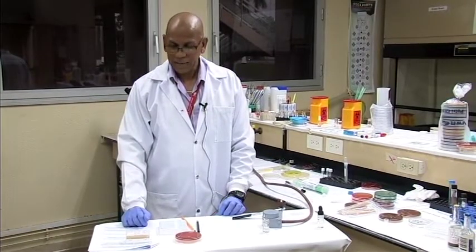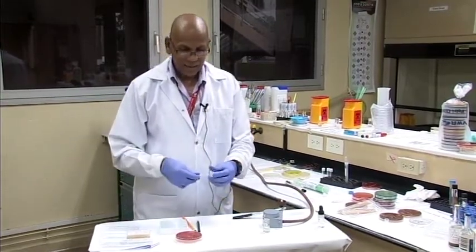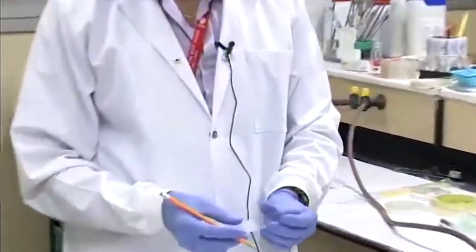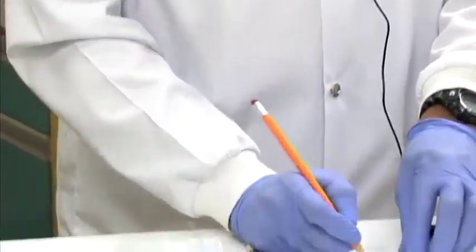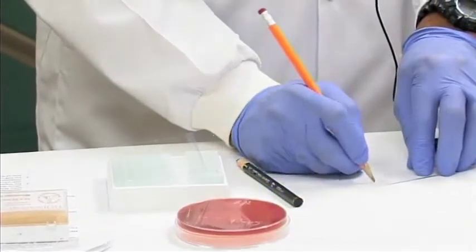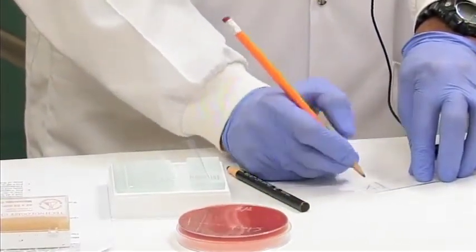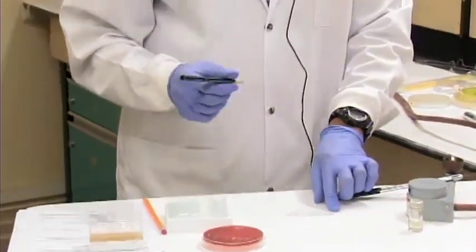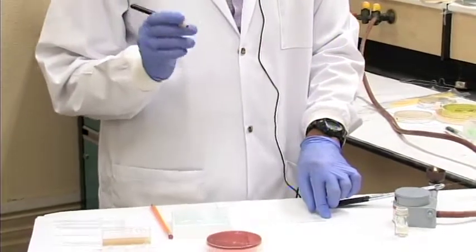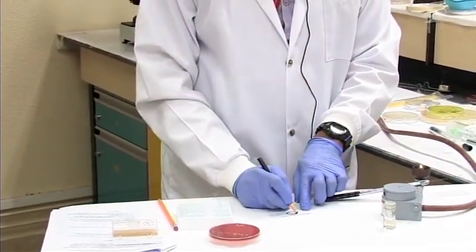The first step is making a smear of your specimen. So what you'll need is a microscope slide. There's a frosted side you want to label, and you can use a lead pencil to label it, because sometimes some markers will erase during the staining process. So you label your slide with a lead pencil, and we also use a wax pencil or grease pencil to make a ring circle on the slide.